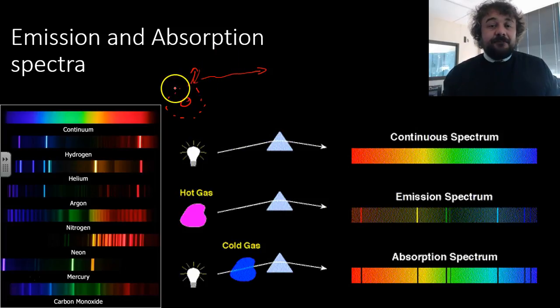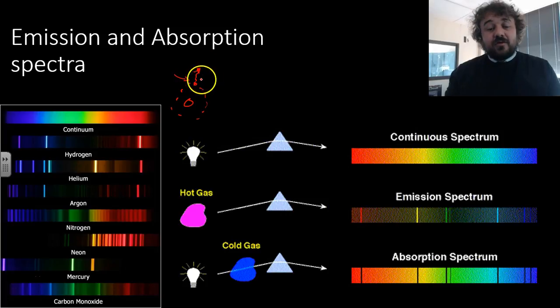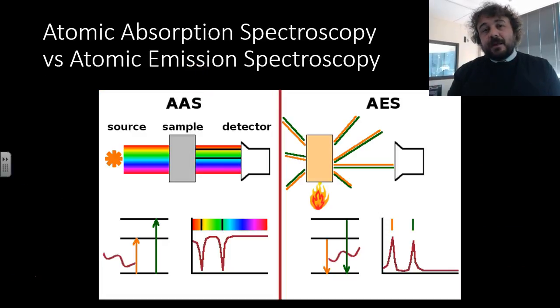Okay? When we're looking at absorption spectra, when the light comes in, what we're observing is just the frequency of light that is absorbed as that electron raises up a level. We're not looking at what happens when it drops back down. So you're going to talk about both of these ideas. And here is the difference.